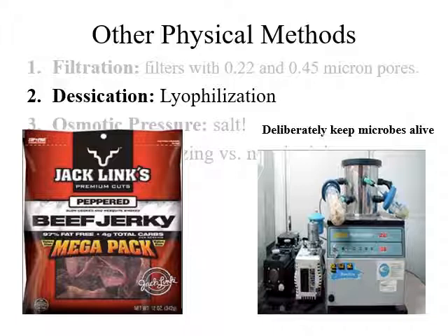It has a receptacle up here at the top where you put liquid nitrogen, and that cools off the sample, and then there's a vacuum pump over here that sucks the air out. So if you put a piece of food in there, you are simultaneously sucking the water out and also freezing it at the same time. After it's been lyophilized, you can take away the cold and you just end up with a powder. That's the main way that they make powdered soups and things like that.